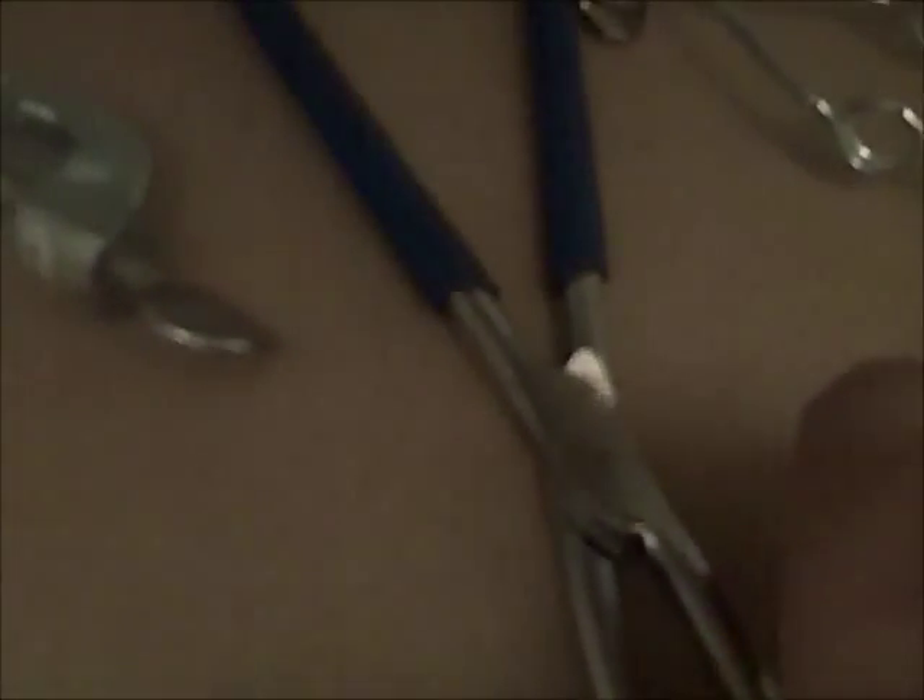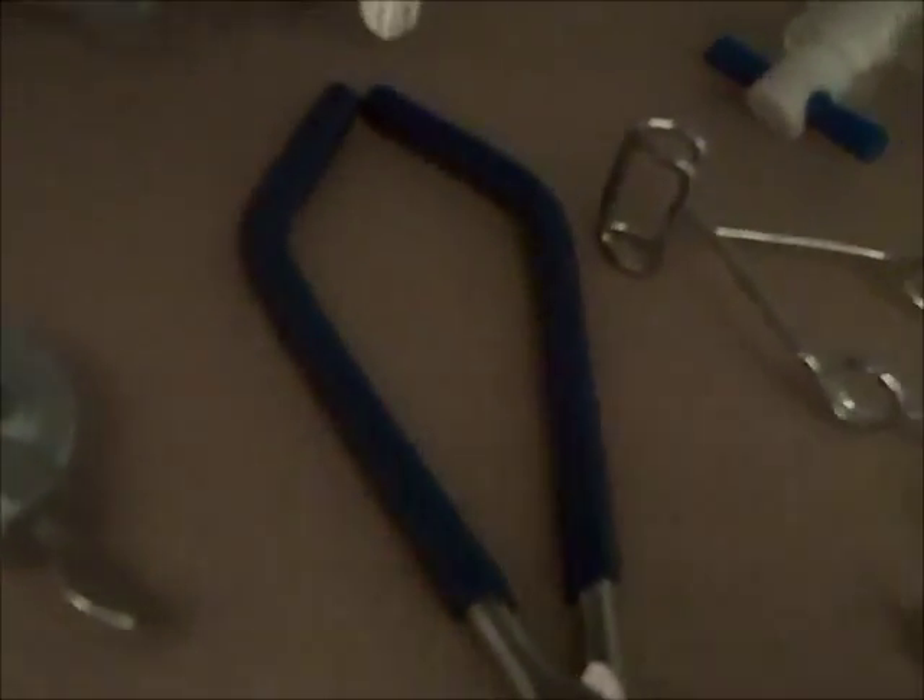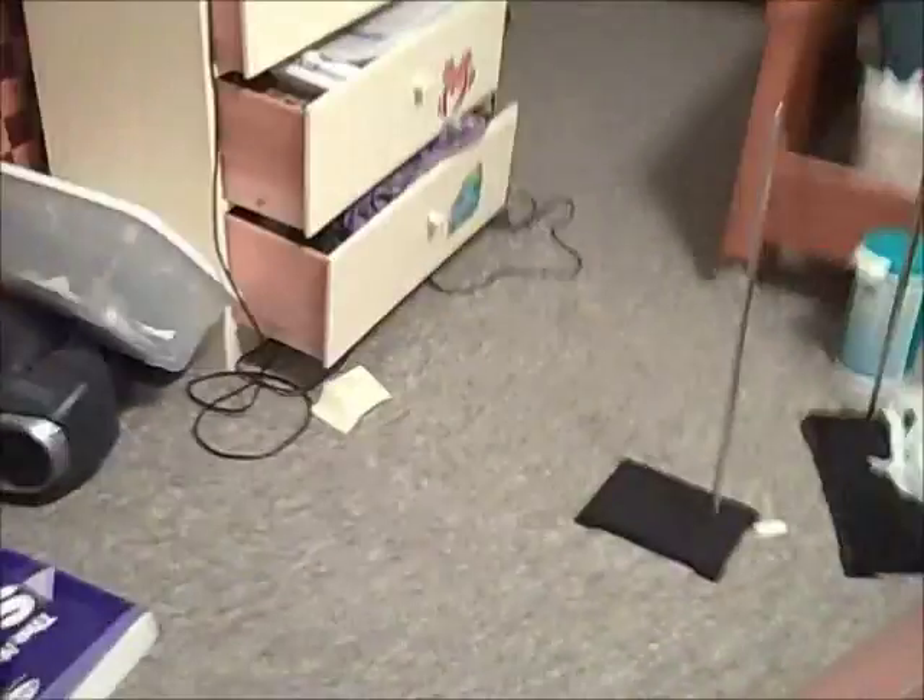And then there's also some other stuff I keep down here. Here's a separatory funnel that wouldn't fit on the upper shelf. And here is a test tube holder, I think. And then here is a tongs that you would use to hold something — like heat-resistant stuff to get your sample out of an oil bath, for example. And then here's some rings that you would use to attach things to. My stands for holding the assembly — you can do a pretty impressive amount of things with these, like attach hardware and then just do reactions using these to help.